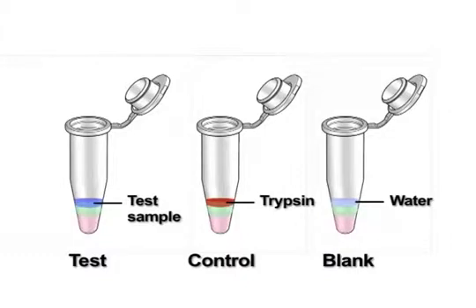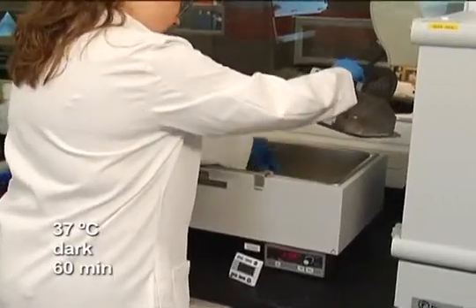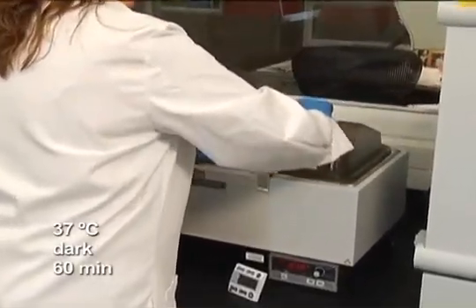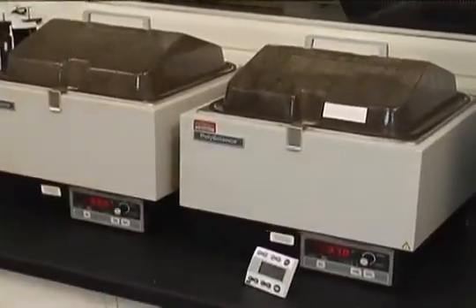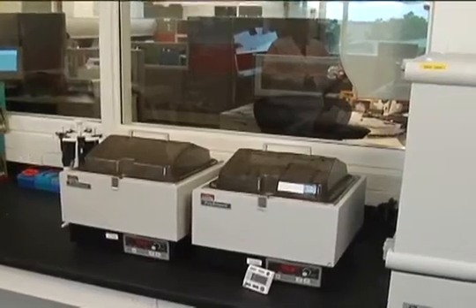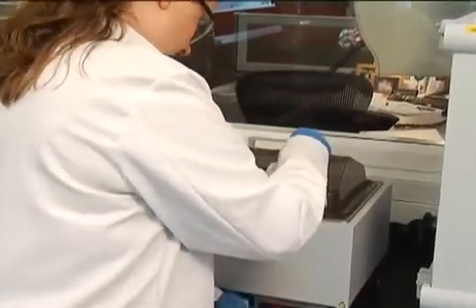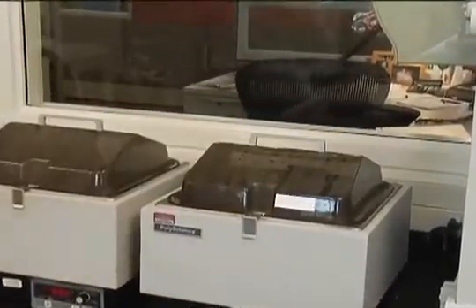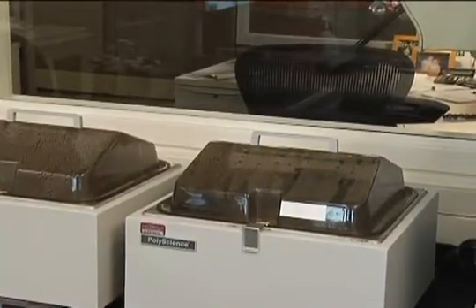With the 3 types of samples ready, gently mix each tube and incubate at 37 degrees Celsius in the dark for 60 minutes. Be careful not to mix too vigorously, as excessive turbulence may cause high fluorescence background and reduce the sensitivity of the assay. One can incubate up to 24 hours to increase sensitivity, but longer incubations are not recommended, as the FITC casein may begin to degrade, again leading to high fluorescence background.